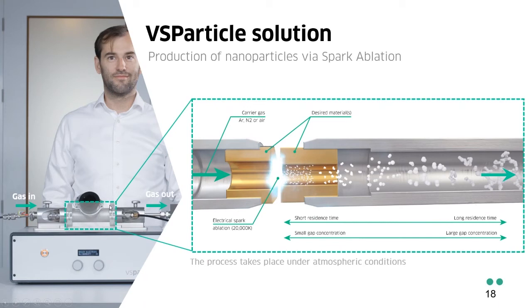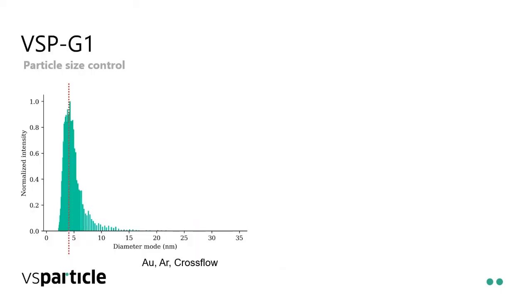That's why this crossflow configuration is interesting, because for people that want bigger particles, it's more convenient to just use this big diameter from this KF system. It's about 40 millimeters internal diameter. So you already have some immediate agglomeration inside the chamber here, and you can continue with high flow rates and relatively high concentrations of bigger particles effectively. So there's a way of using the same system either for the very, very tiny stuff or the somewhat bigger stuff.